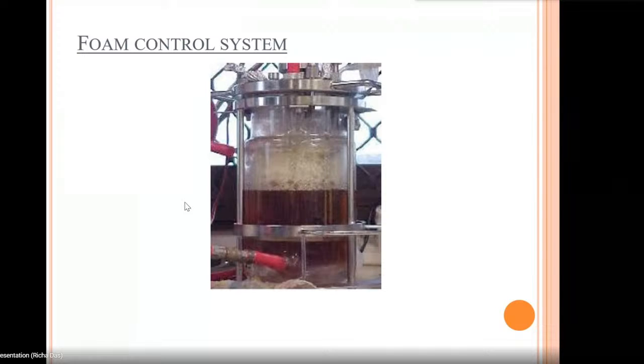And because of this unwanted pressure, what will happen? It can lead to damage of the microorganisms, it can kill the microorganisms, and loss of production media can also happen. Most importantly, sometimes because of such pressure buildup, fermenters blast, and blasting of fermenters is very injurious to all those people who are present in or outside that facility.